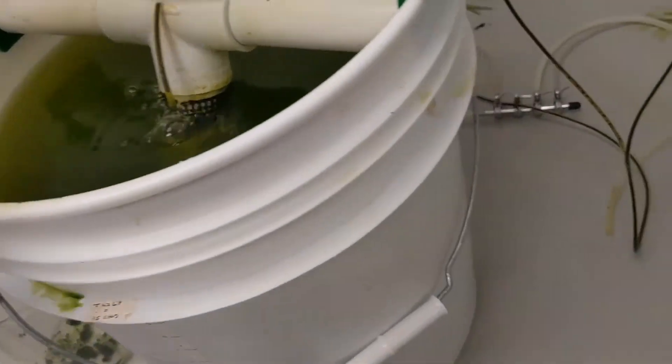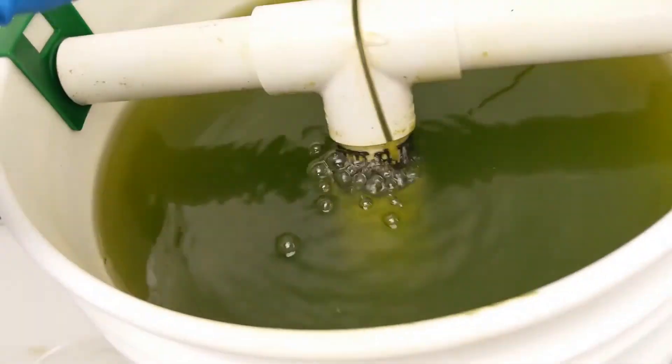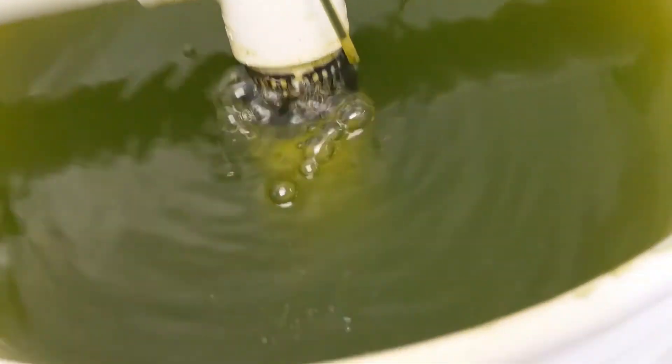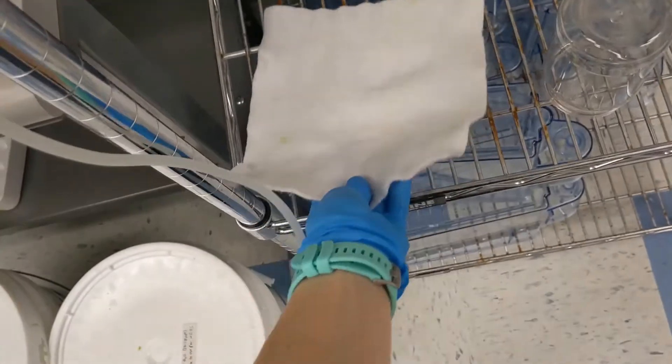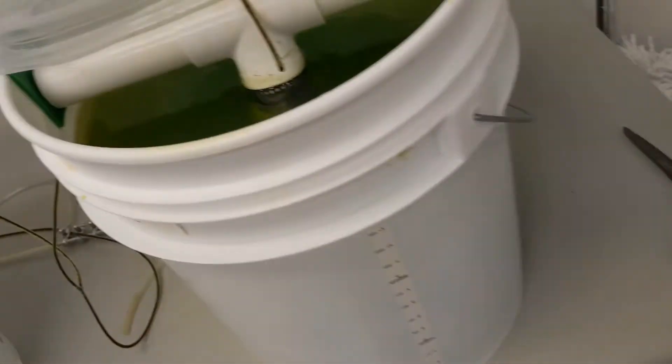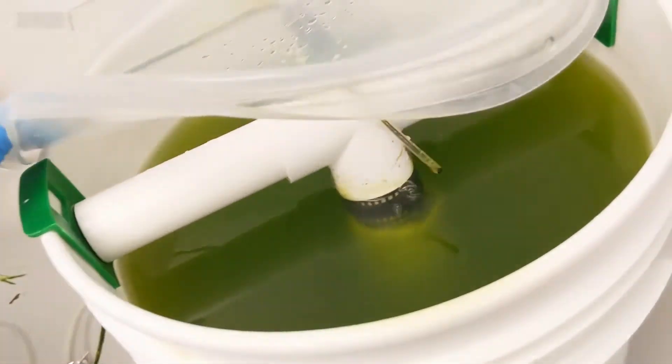We do daily bucket dumps of about 20 to 50 percent depending on how much ammonia has built up overnight or throughout the day. Additionally, we replace the filter floss every day to help keep the debris down in the bucket and reduce the ammonia.